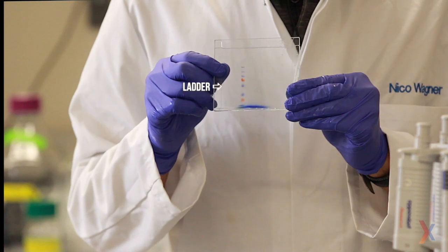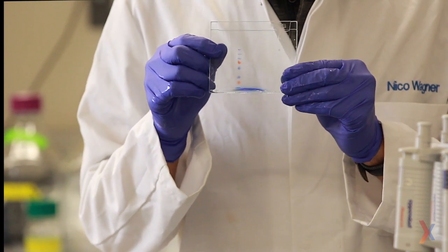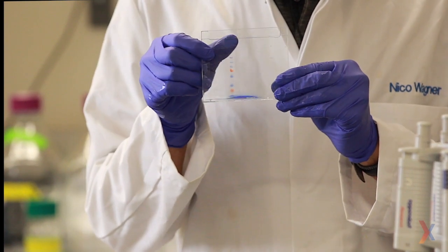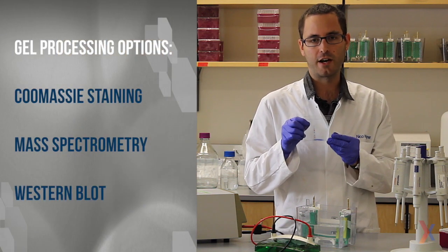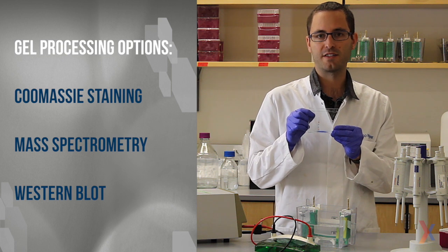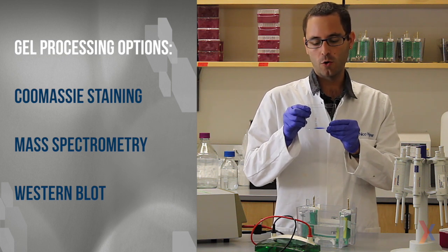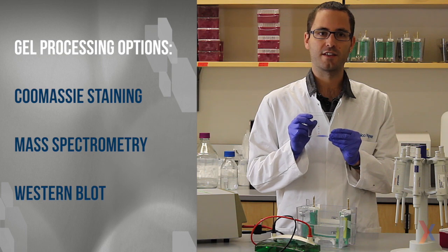From here on out you can do a few things with this gel. For one, we can take the gel out of the glass cassettes and do a Coomassie stain to just look at the protein bands that we have. Alternatively, we could cut out the protein bands and submit them for mass spec sampling, or we could take the gel out and do a Western transfer with this.